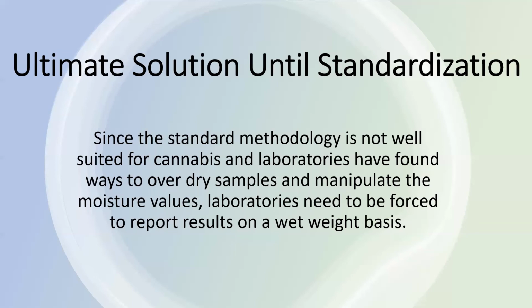However, the problem that we run into here is that the standard methodology being used is not well suited for cannabis, and laboratories have found ways to over dry and manipulate the moisture values. Laboratories need to be forced to report on a wet weight basis until more industry standardization can be created.